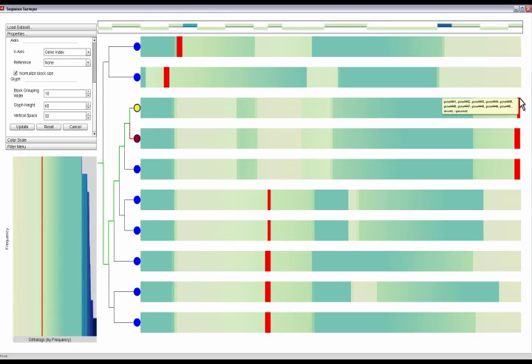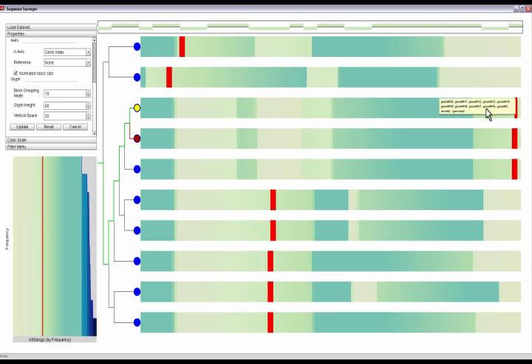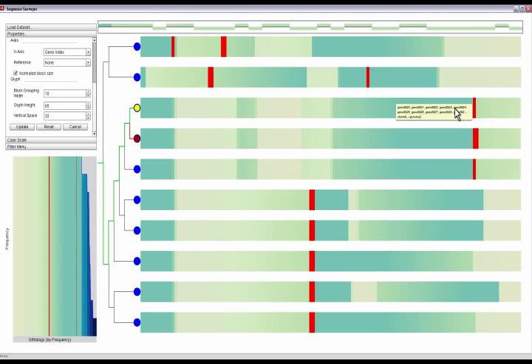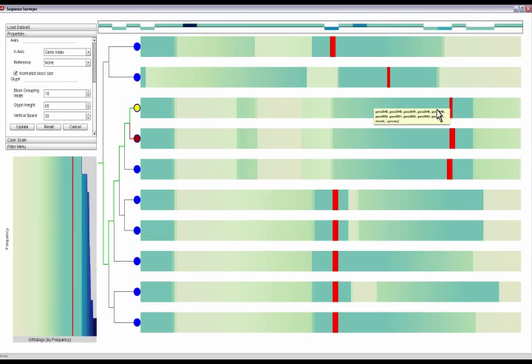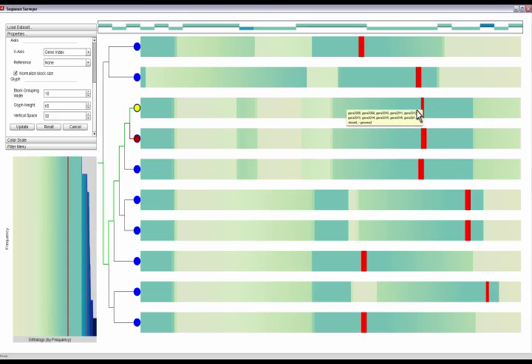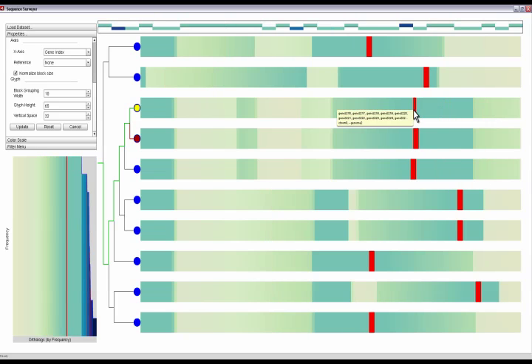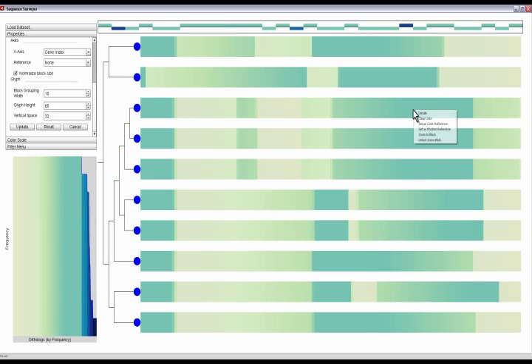Each row is grouped into blocks that contain many genes. The contents of the currently selected block are shown in the zoom window at the top of the ordering.